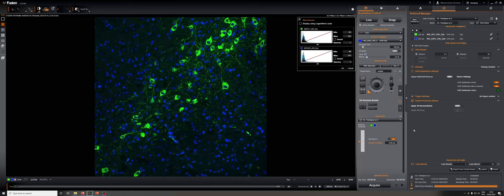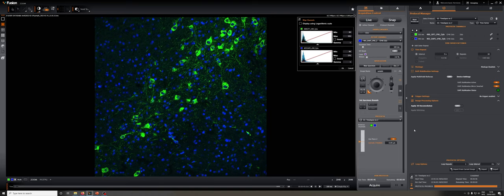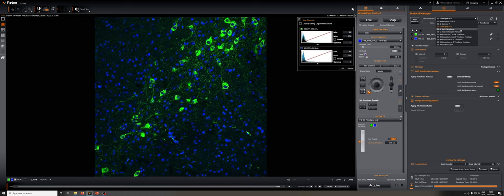So now that we have some of the basic protocols, let's explore a few other protocols that layer in more complexity. Those are the ZStack time-lapse or the ZStack time-lapse montage. I'm going to go to the ZStack time-lapse montage, since it's the same as the time-lapse, but it just adds the montage option as well.